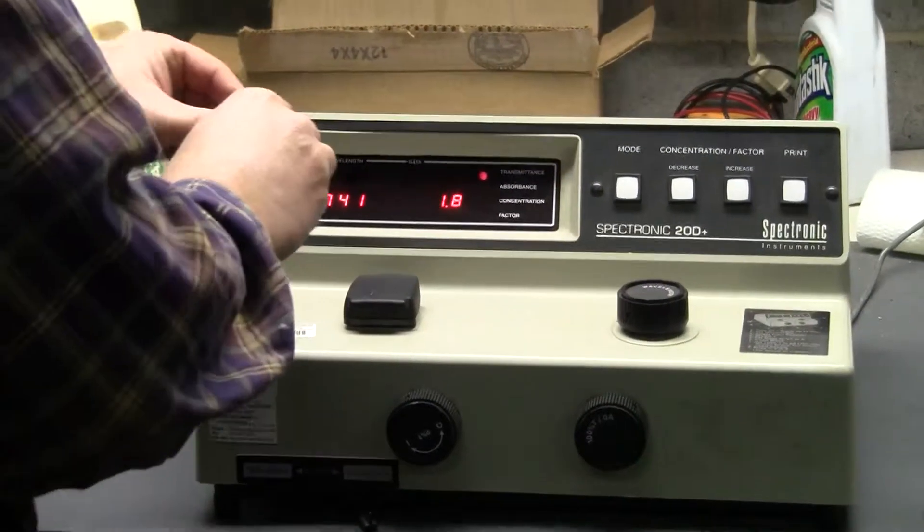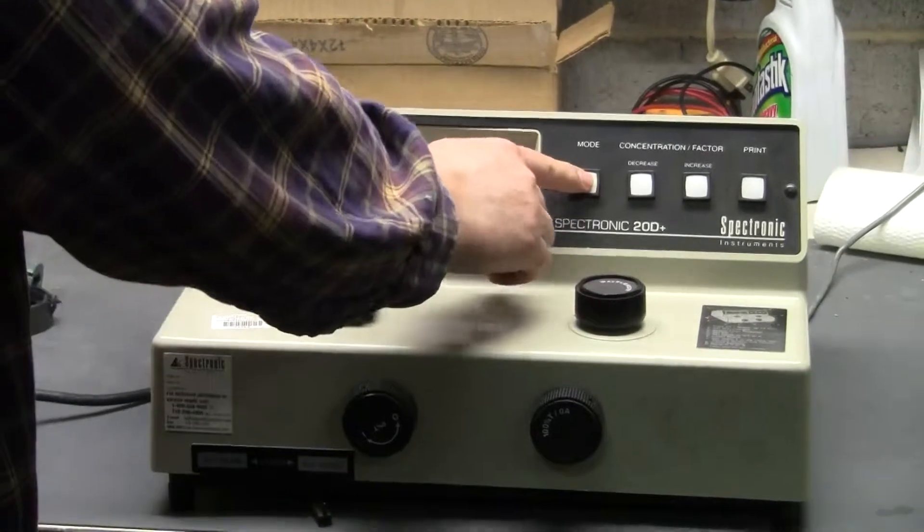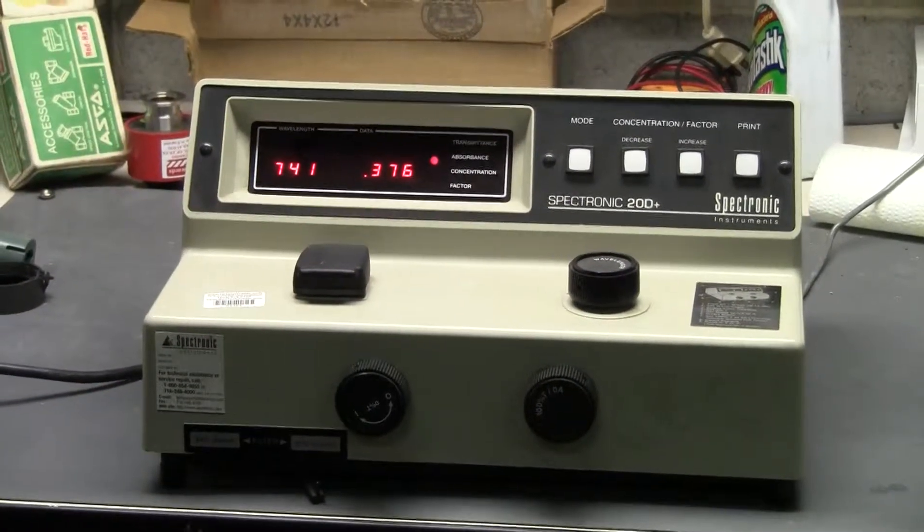Today we're putting in a standard Didium sample. 0.376.